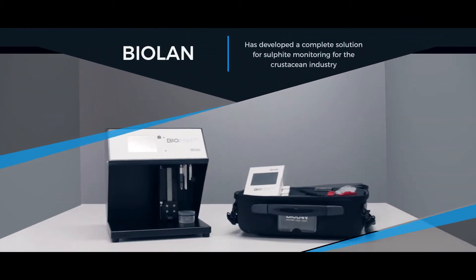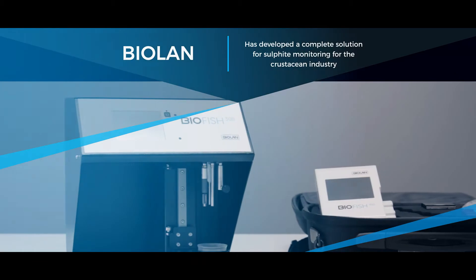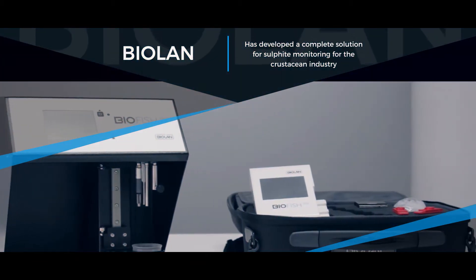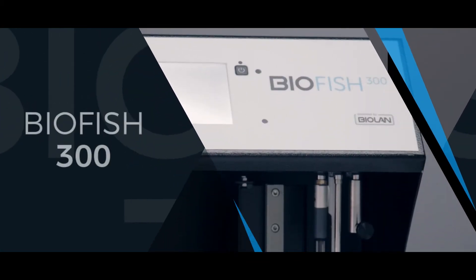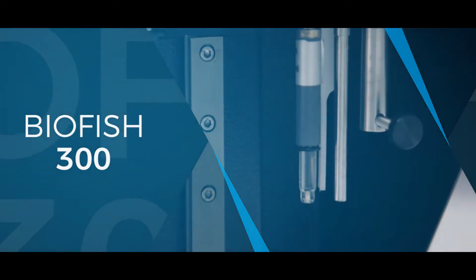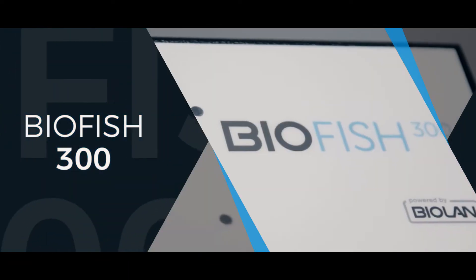Biolan has developed a complete solution for sulphite monitoring for the crustaceans industry, enabling fast, accurate and simple sulphite testing. BioFish 300: a tabletop biosensor in order to quantify sulphite in crustaceans.